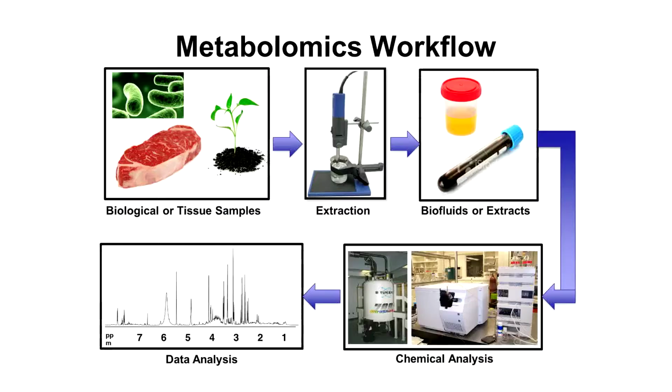So this is, I think, the great advance that's happened, and it's needed a lot of software, a lot of databases, a lot of innovation. And it's still happening, so it's not fully mature. But it's this step, as I say, which has been the critical advance that's allowed metabolomics to sort of move from the back room to the front room.